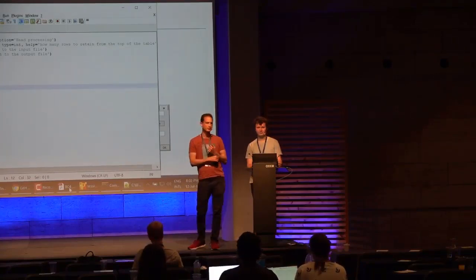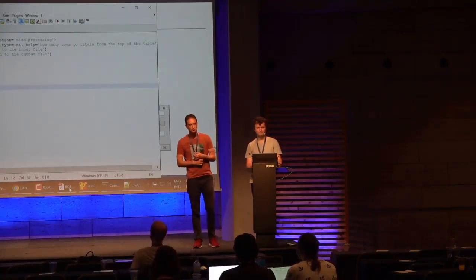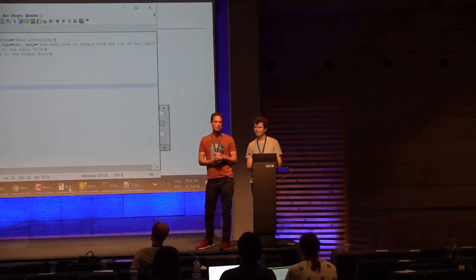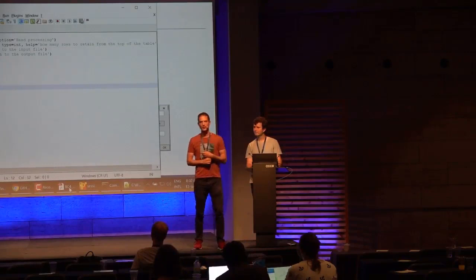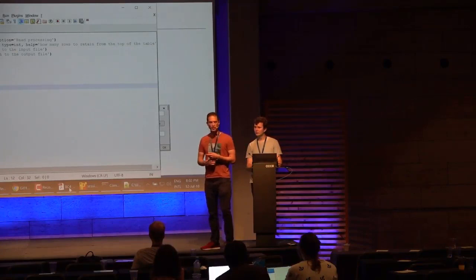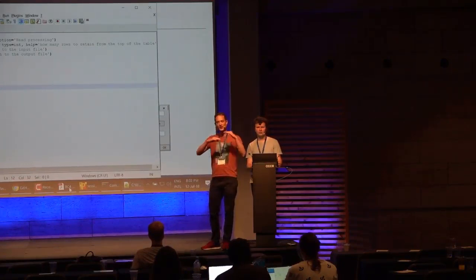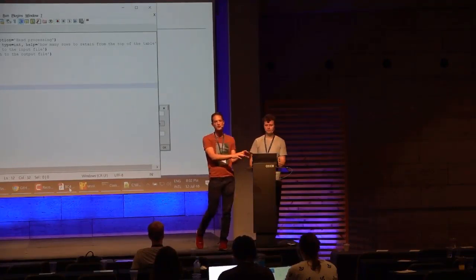And Pandas is just loaded in the Perseus Pi? Yeah, exactly. So if Pandas is updated by the developers, you just don't need to do anything. Just download it. So we use the latest one. Yeah. Actually, there's a new version 0.23.1 that has introduced a bug into Perseus Pi that was fixed recently. So there's always the latest. Whatever version of Pandas you have installed will be the one that Perseus Pi uses.